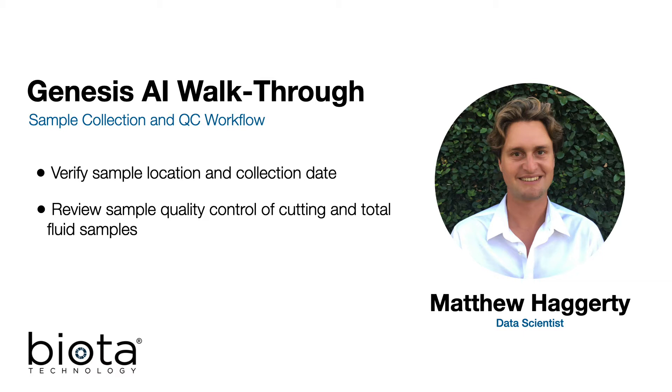In this session, we demonstrate how Genesis AI organizes our sample collection information for both well cuttings and produced fluids. We also present our strict quality control cutoffs to ensure the highest quality DNA signal is carried into downstream analysis.